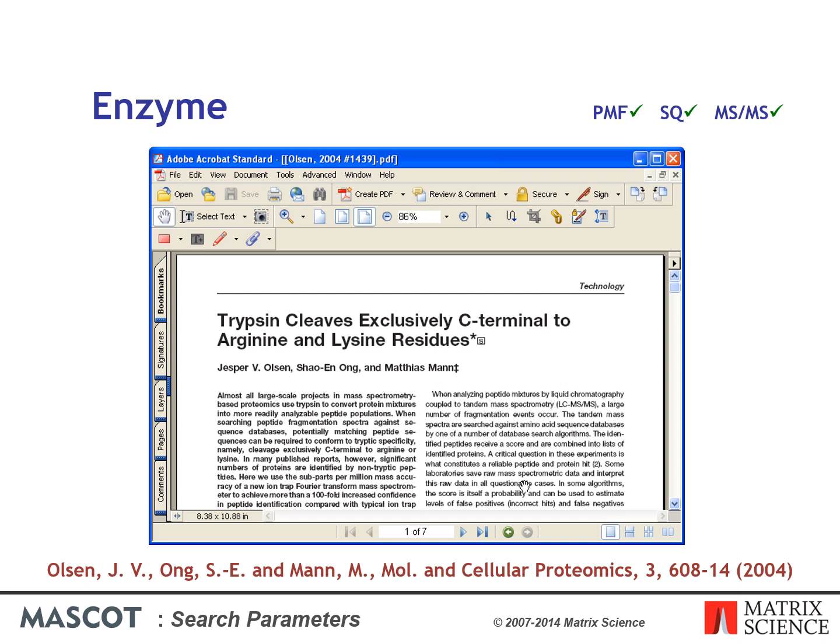There is some controversy of the level of non-specific peptides that can be expected in a tryptic digest. Our experience is that the levels of non-specific peptides are very low, less than 3%, unless there is something seriously wrong with the trypsin or the protocol. Why do we advise so strongly against no-enzyme searches?